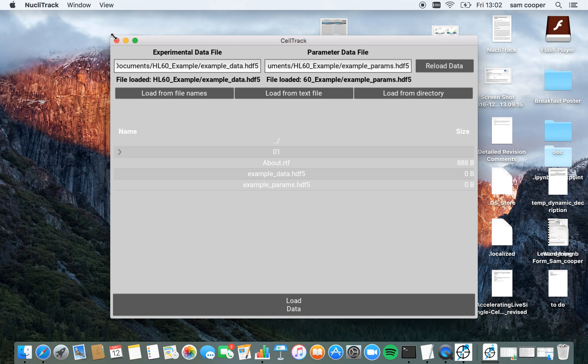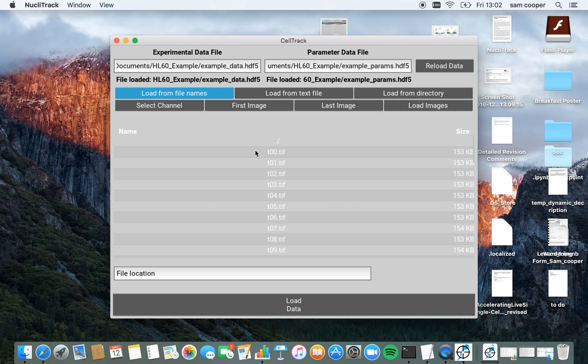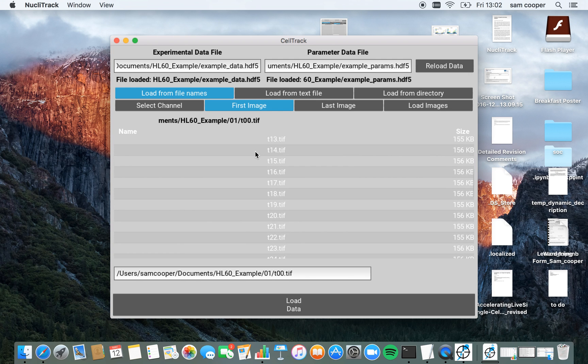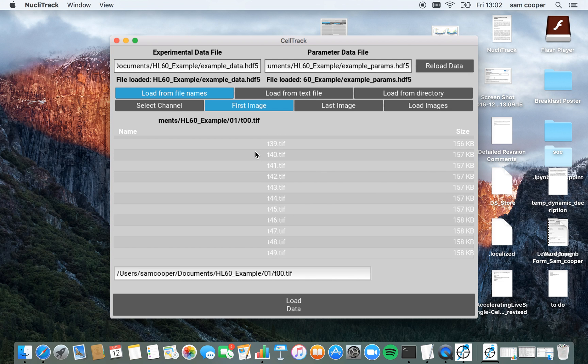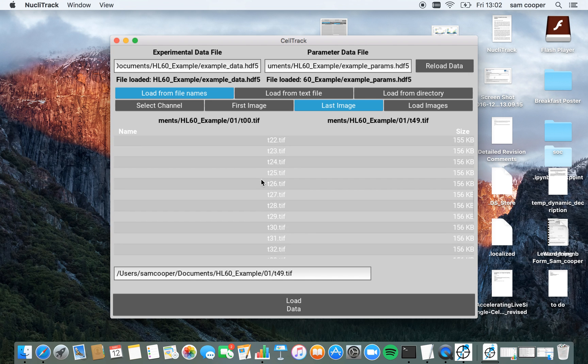I'm now going to select load from file names. Navigating into the folder, I'm going to select the first image in this time series of single plane TIFFs, as well as the last image.